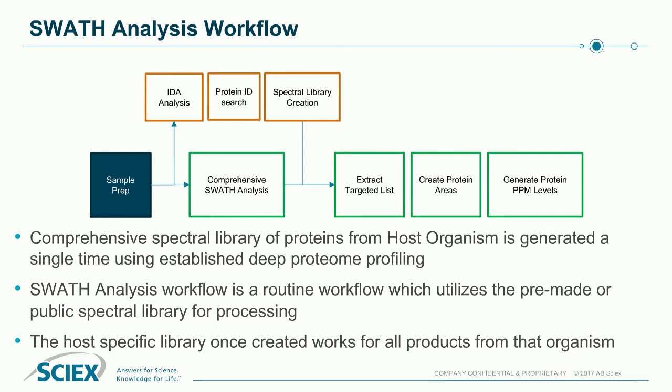In general, what many users who are using SWATH will do is take a stock sample and do exhaustive analysis on this to identify as many proteins and peptides as possible within that sample. This is shown in the top part of this block diagram here. It uses our IDA analysis, followed by protein identification searching, and then this step of spectral library creation. This can be single-dimensional chromatography or multi-dimensional chromatography. As I'll describe from BTI, we use many dimensions to get here.